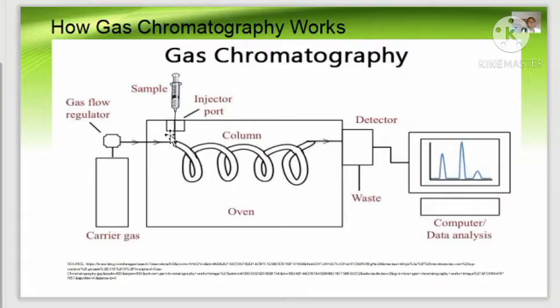of the chromatograph manageable. The tube may be open, called tubular or capillary, or filled with a divided inert support material called a packed column. The tube is long to allow for a better separation of components. At the end of the tube is a detector, which records the amount of sample hitting it. In some cases, the sample may be recovered at the end of the column too.